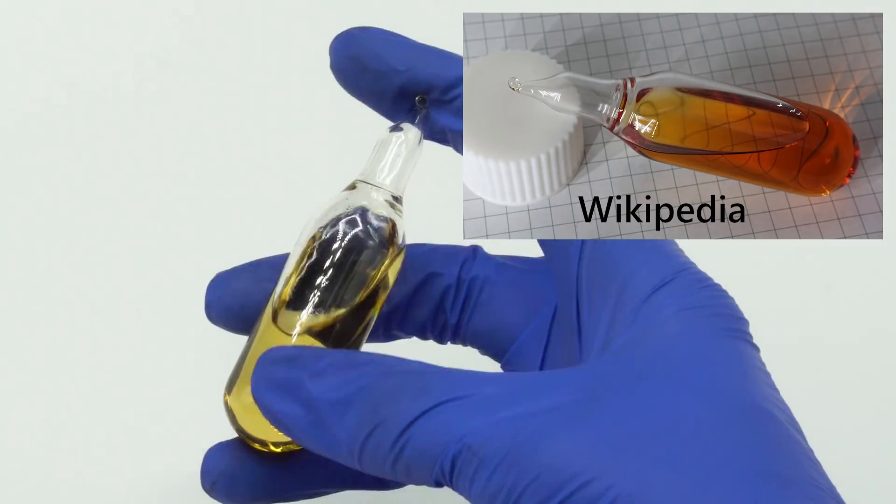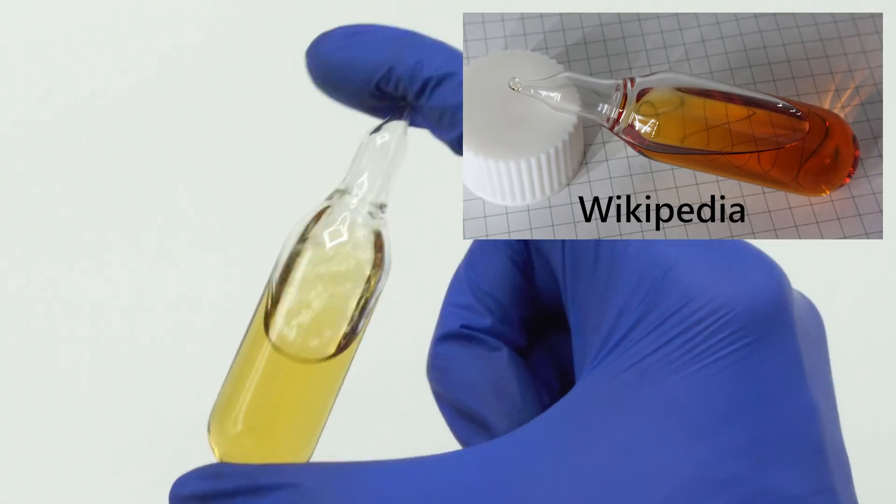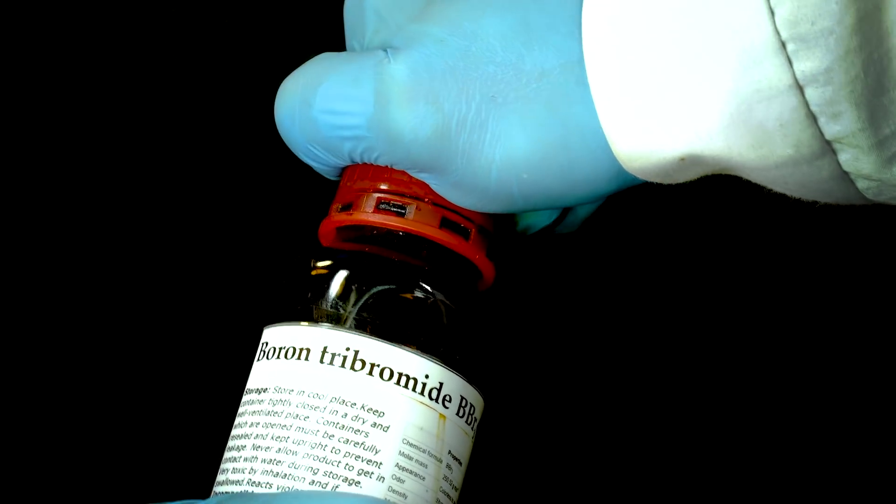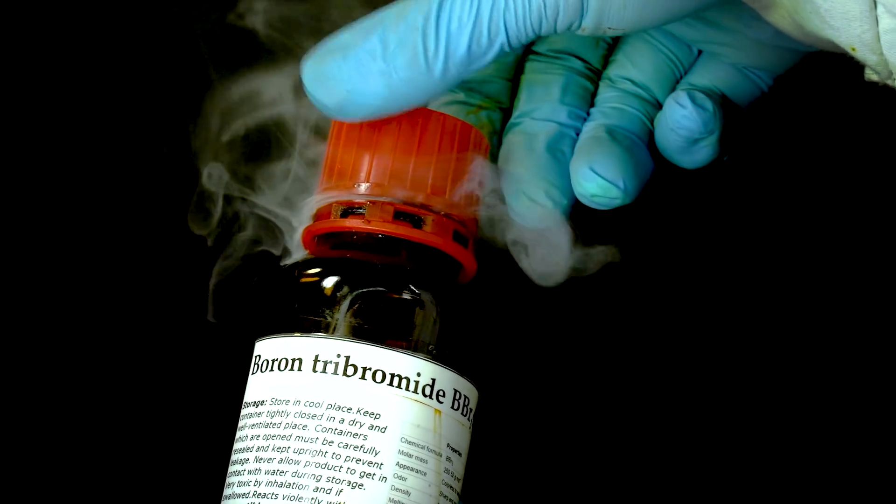Look at this ampoule, it contains 20 milliliters of boron tribromide. This yellowish liquid smokes in the air very actively, forming fog from hydrogen bromide.